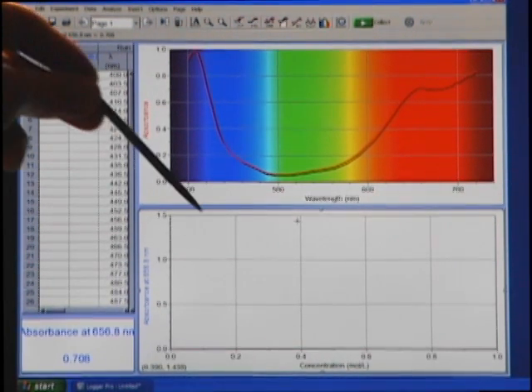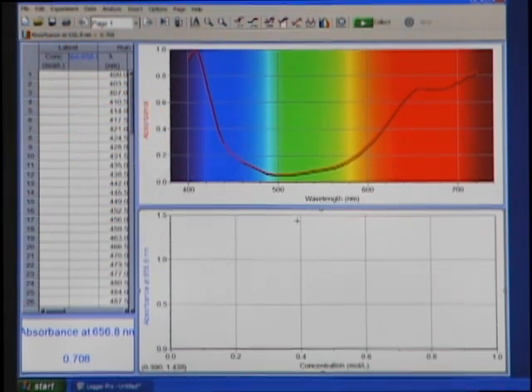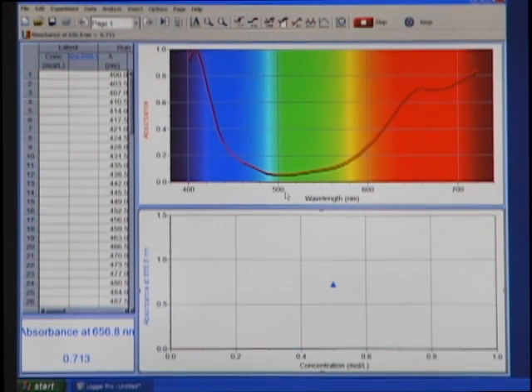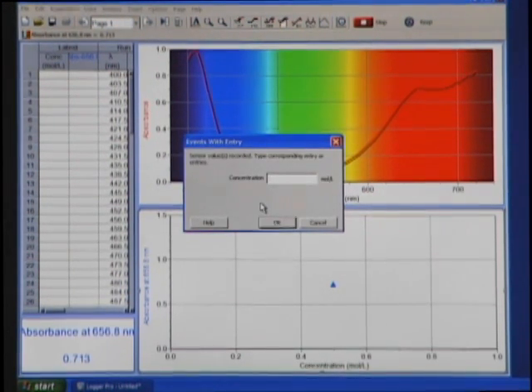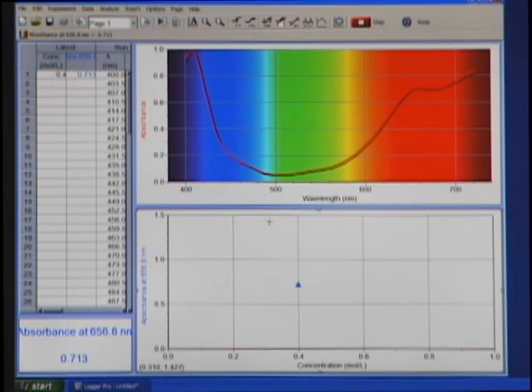But now I have a new graph down at the lower half of the screen that has absorbance versus concentration for each of those Beer's Law standards. I'm going to go up and click on Collect and begin data collection. I already have the first standard solution in there. It's 0.40 molar nickel sulfate. So as soon as that value is stabilized, notice the live reading down in the lower left-hand corner is 0.713. I'll click on the Keep button just to the right of the Stop button. And I'm prompted to enter the concentration, which is 0.40 molar. And I'm going to click OK. And we've now kept that particular value right in the middle of the graph.